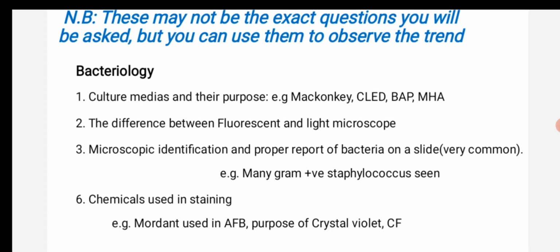So we have to start with their number, then gram reaction, then their bacterial genus and species. Just reporting is not enough; we have to follow the correct format. This format is very important, and it is a very common question in the microbiology section of exit exams or clinical practicum exams.